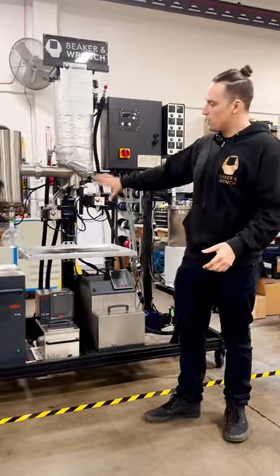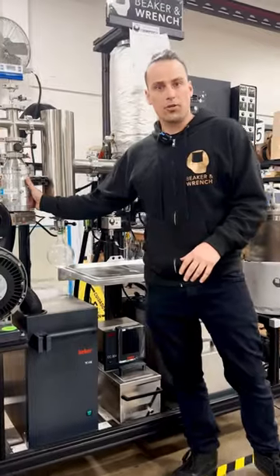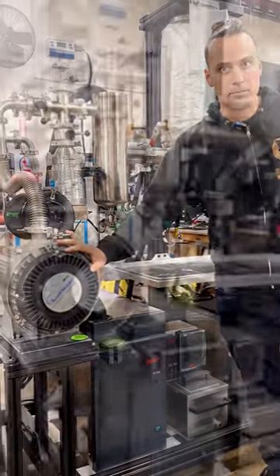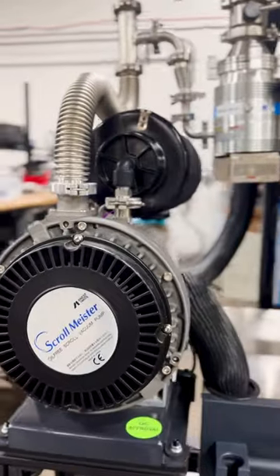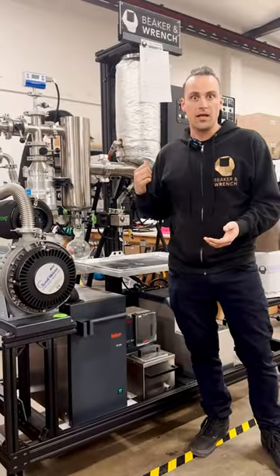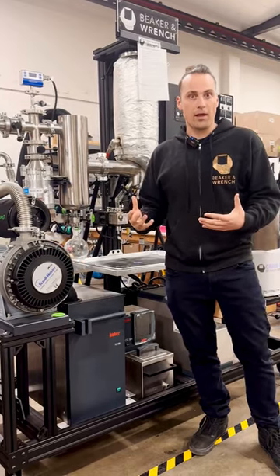The primary difference for the European model is that the default option is with a dry turbo pump and a dry scroll pump. This is done particularly because EU GMP requires clean rooms for most of our applications, and it's just easier to use dry pumps that don't have any oil or vapor coming out of them.